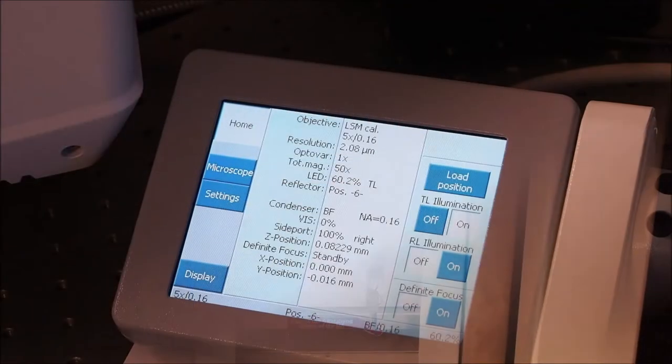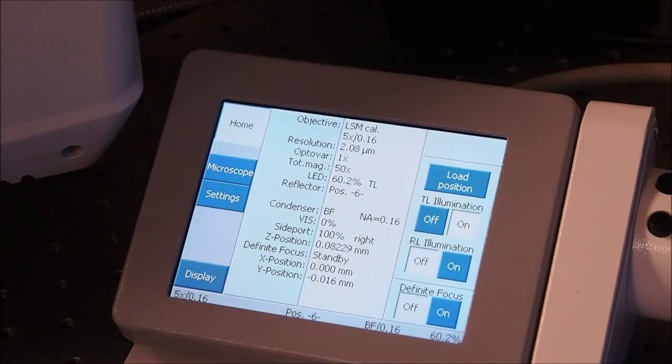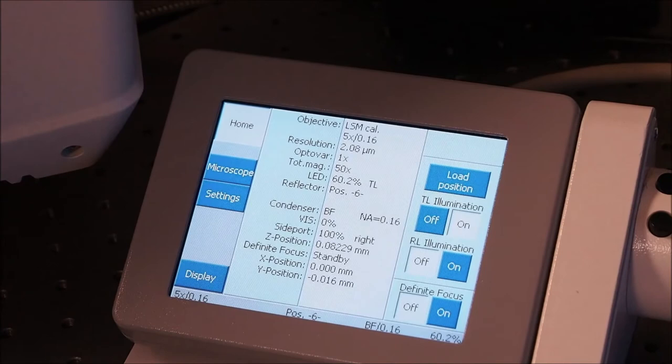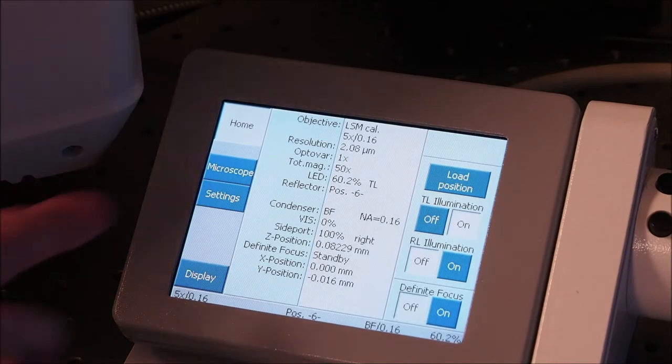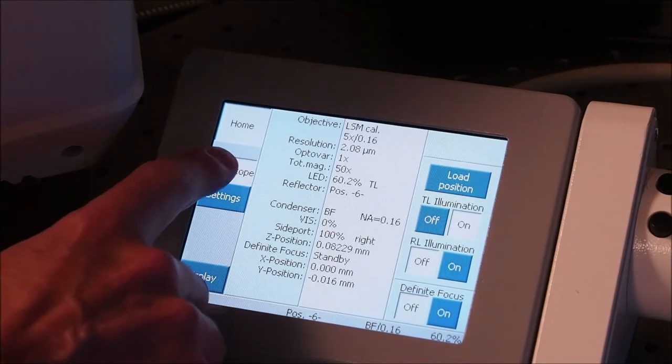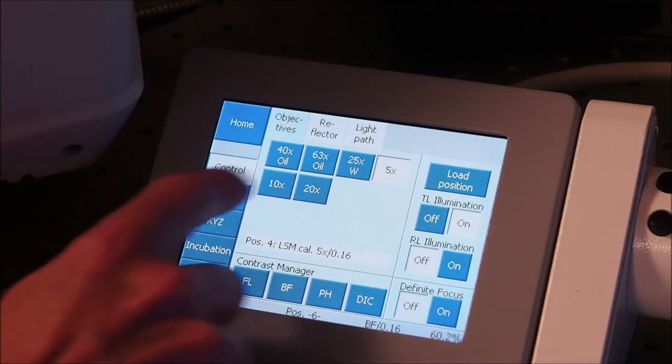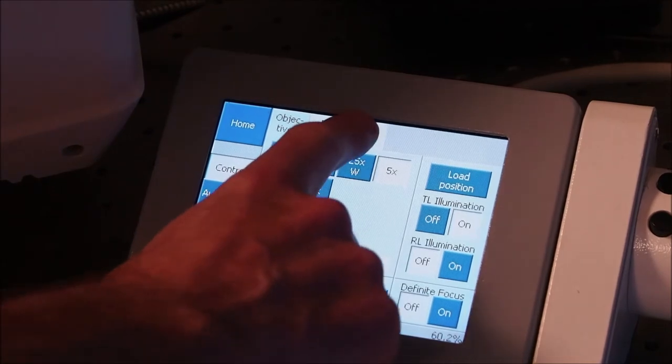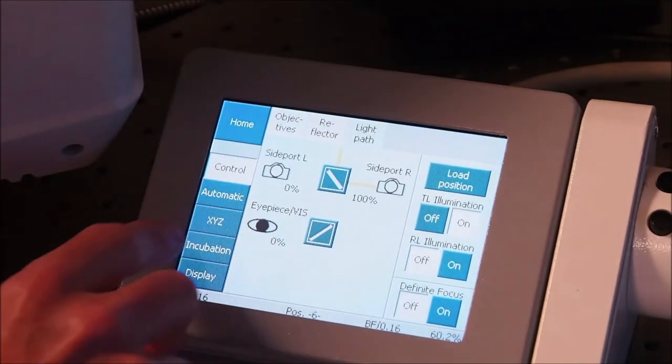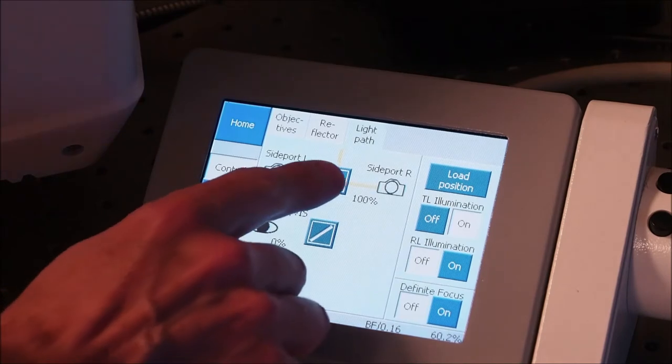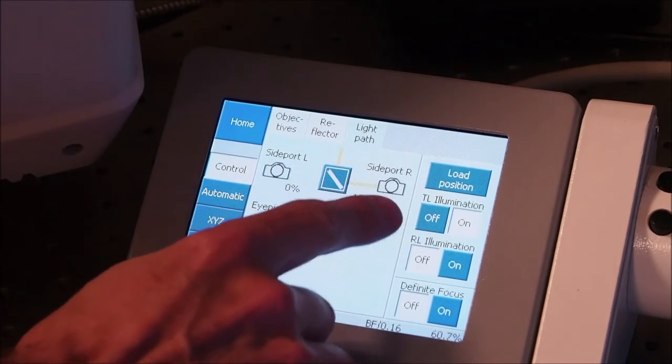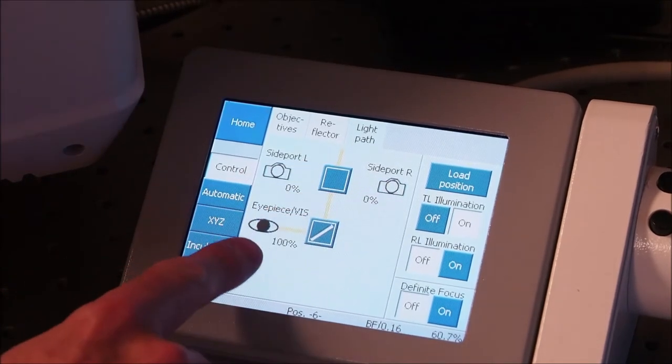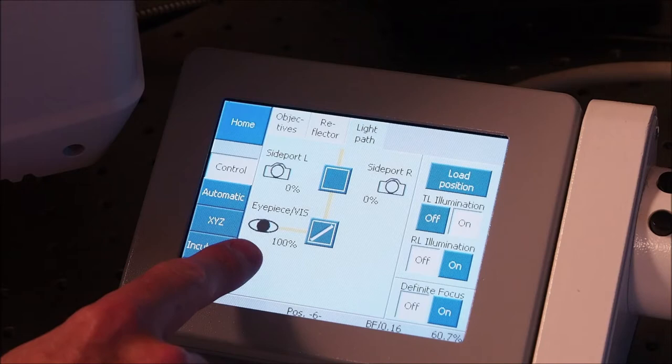When the microscope has booted, the TFT screen will display the home page. To visualize your sample using the eyepieces, click the microscope tab button and then choose the light path page. By default the light path is to the side port R scan head. Select the mirror that points the light in this direction and it will swap to pass the brightfield light to the oculus.